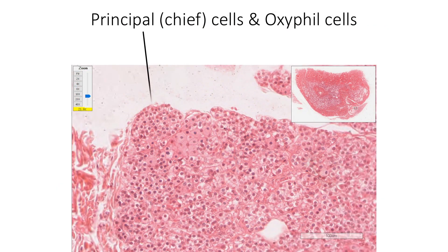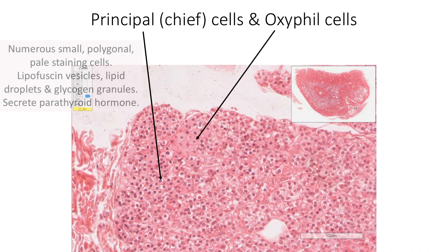Two types of cells are seen in parathyroid gland: principal cells or chief cells, and oxyphil cells. Principal cells are the most numerous. These are small polygonal pale-staining clear cells with a central nucleus. Cytoplasm contains lipofuscin vesicles, lipid droplets, and abundant glycogen granules.